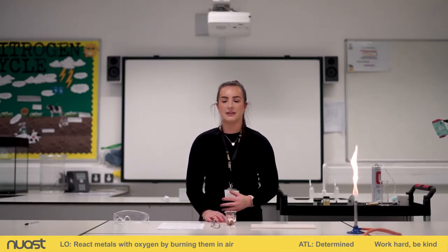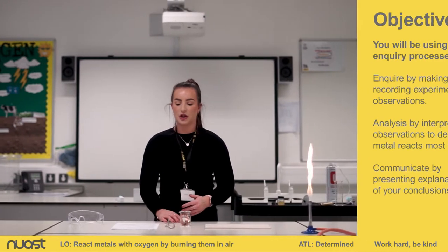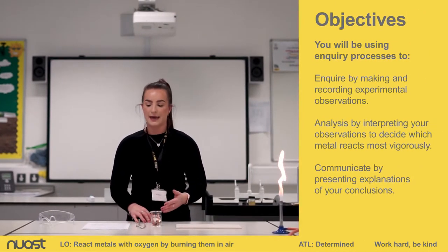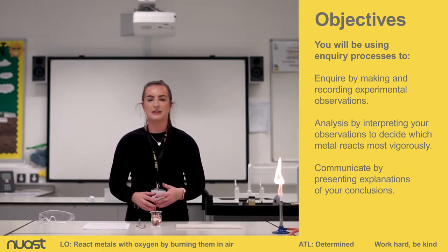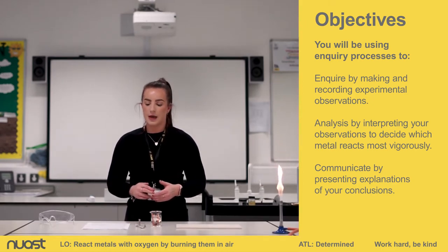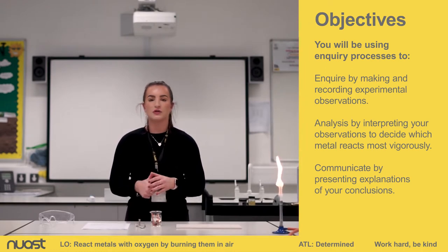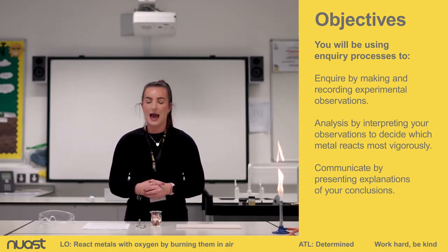The aims of today's lesson are to see how metals react with oxygen when they burn in air, and to record our observations to decide which one reacts most easily with oxygen. Some skills that we're going to acquire today: we're going to use observations and data to make conclusions, and we're going to give reasoned explanations.